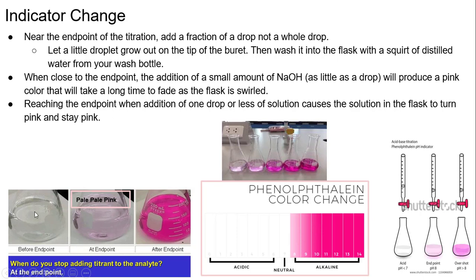Why is it a big deal? Because you could have this and in 1 drop you will get that. That's how sensitive this is. So that means that you should have only done a half drop to get to the pale pink.